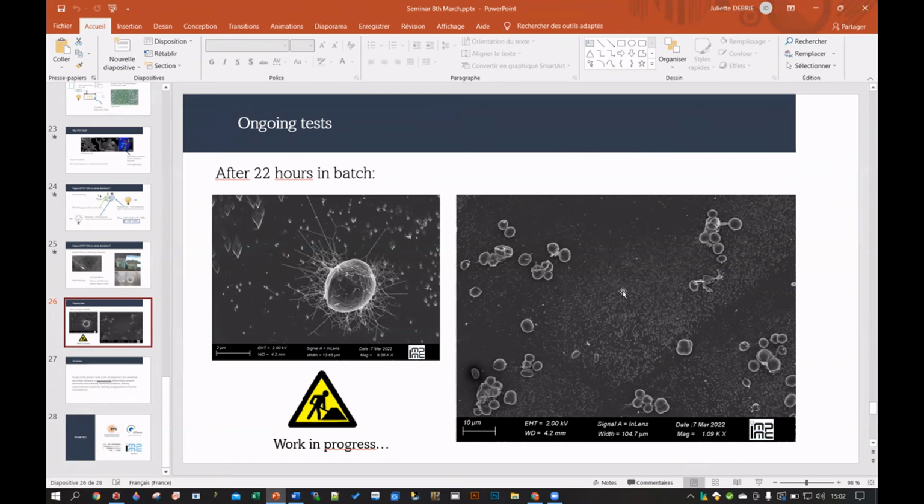So probably we will have to do that with different samples. On one end, we want to see the biofilm itself, to look at the cells. But on the other hand, we also want to remove all the cells at the end of the experiment, and then look at the topography itself and see what their impact is, what their signatures are.